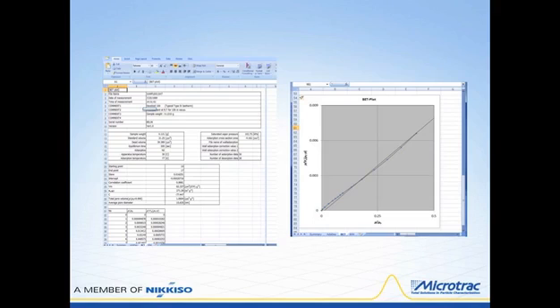is we have this black line, and this black line is the linearization of the BET calculation. This is the actual BET calculation here, but it's necessary to have as straight a line as possible. It must be as linear as possible. So knowing that the lowest relative pressure used is down at 0.05 at this level here, that is the starting point for us developing this particular line that's used for the final BET surface area measurement.